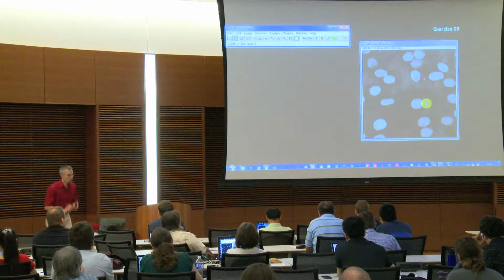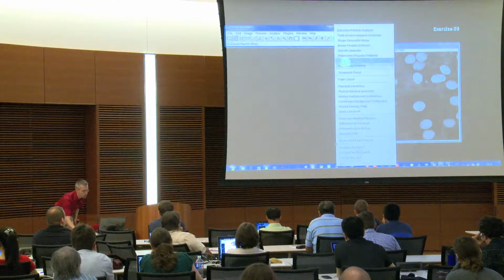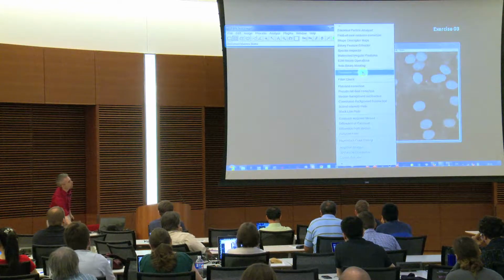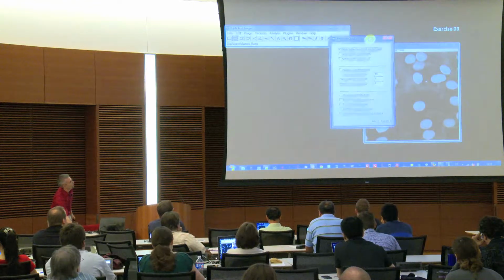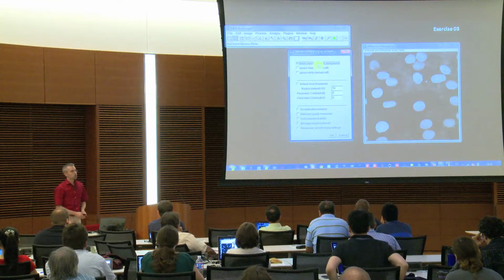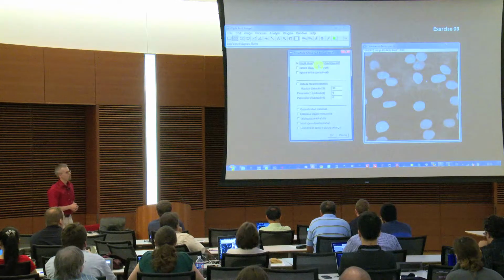And now, from here, we start the threshold check. So, green cube and threshold check. As mentioned, we have bright objects on a dark background, so that should be active. We don't use ignore black and white.